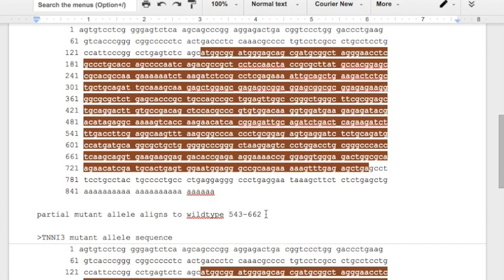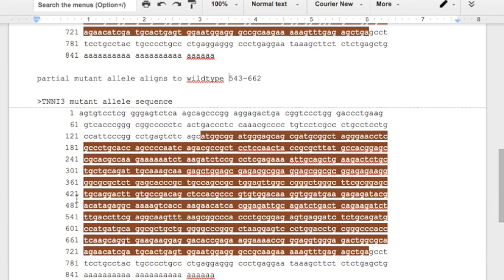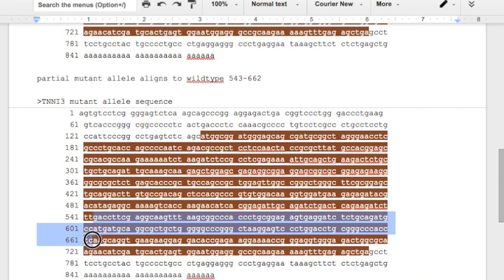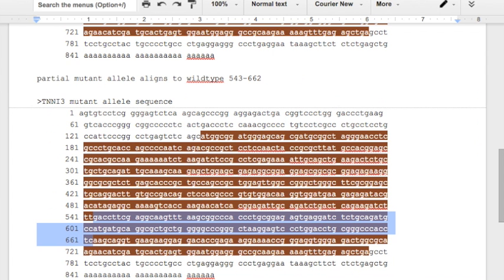So what we can do is highlight these and then replace them. So 543, if we look right here, starts right here, starts right here. And then 662 is going to be down here. So 543 to 661, 662. Just to double check. The first three letters here, GAC, and then ending with CTC. GAC, CTC. We know we've got the correct spot.